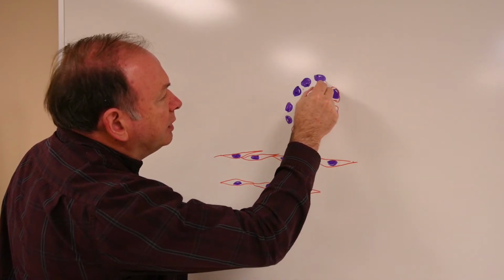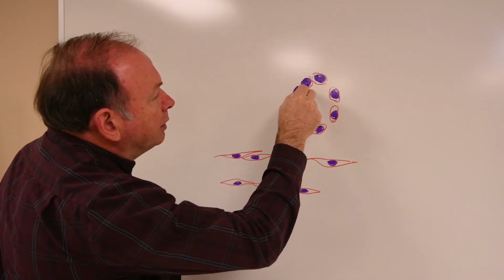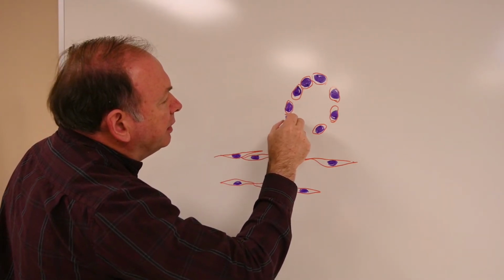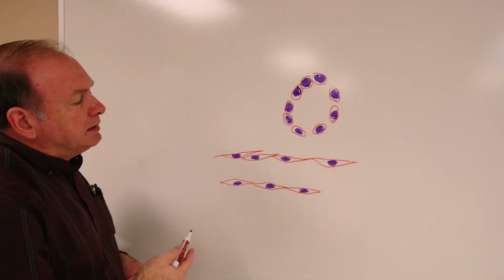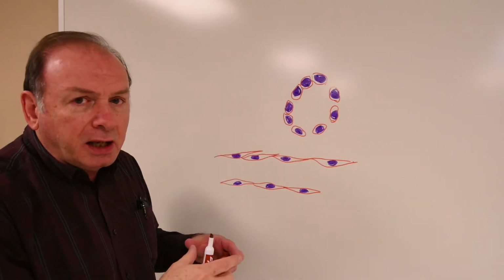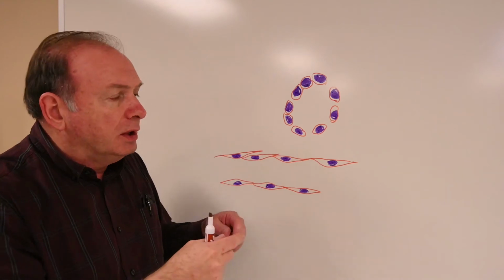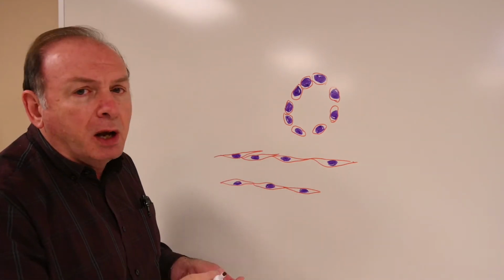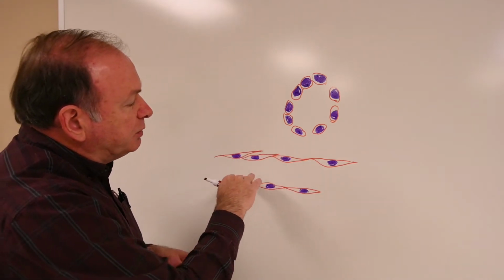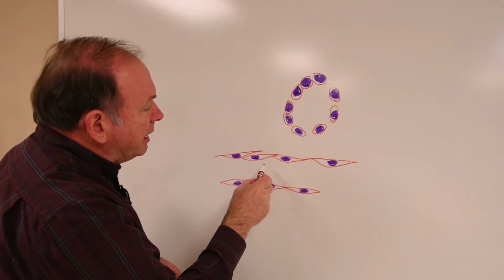In cross-section, there's not much beyond the nucleus in a cross-section of these endothelial cells that line the sinuses. And there are significant gaps between the cells, not like the continuous walls we see on most blood vessels. So a lot of gaps, a lot of spaces between these elongated, narrow cells.